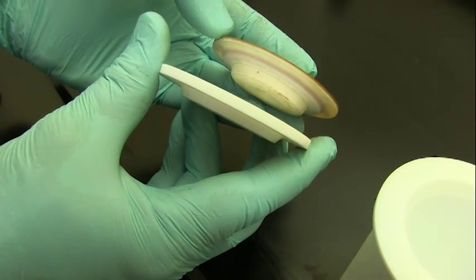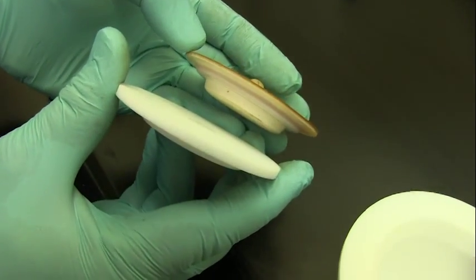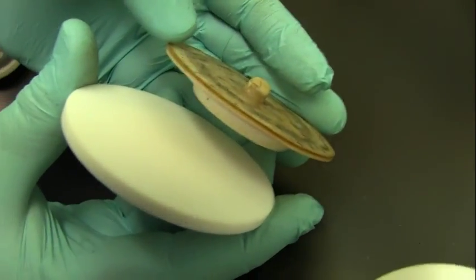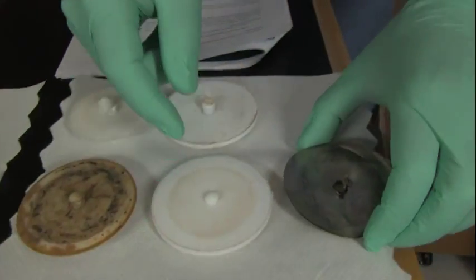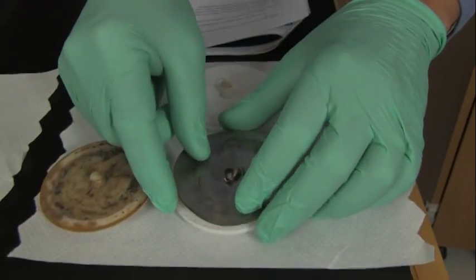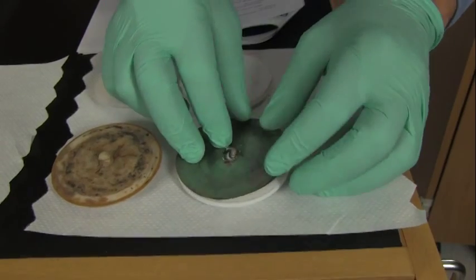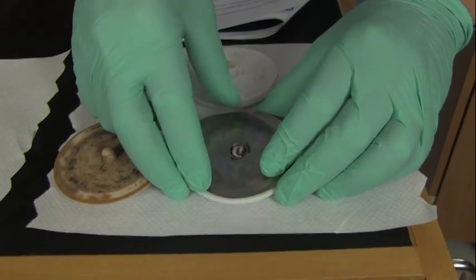The extent of the creep effect will be roughly proportional to the maximum operating pressure. PTFE cup and lid lifetimes as short as 10 to 30 runs have been reported. Here, an overpressure may be released through a small opening in the pressure plate after breaking through a sandwich of a corrosion disk and rupture disk over the PTFE lid.